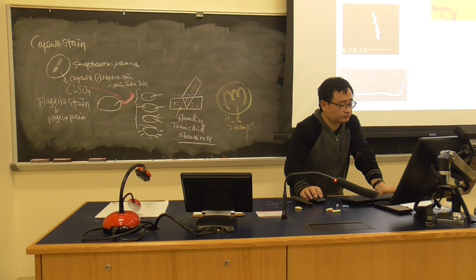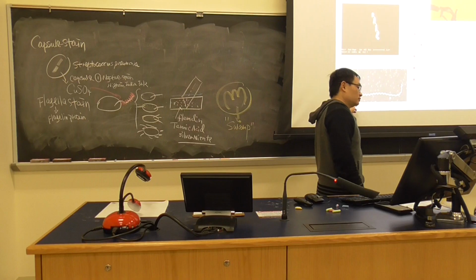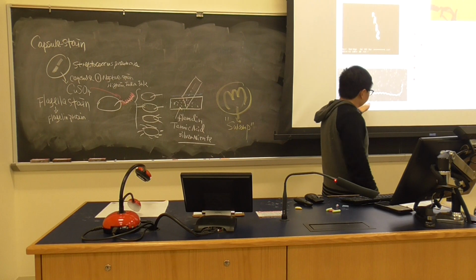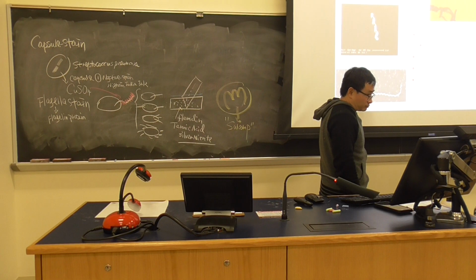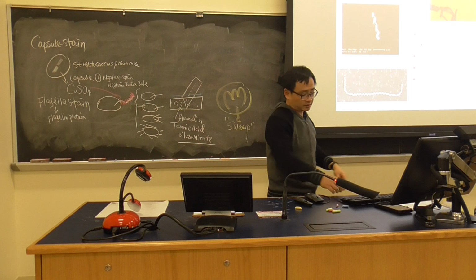Campylobacter jejuni is a spiral-shaped bacterium. We will mention it in our last section; this is a major pathogen in poultry meat. Leptospira interrogans is a spiral with a sheath and a hook shape. So what is this one? They use a dark field microscope. Can you see the background is dark? The bacteria show up. That's very interesting. A couple of slides talk about that.